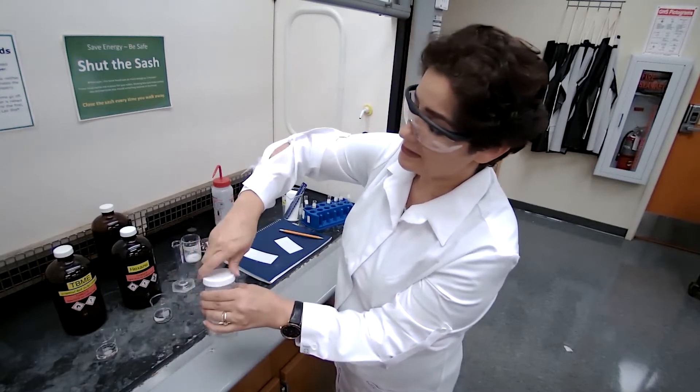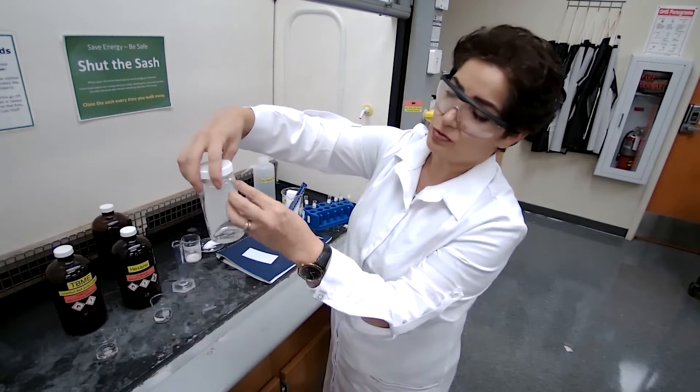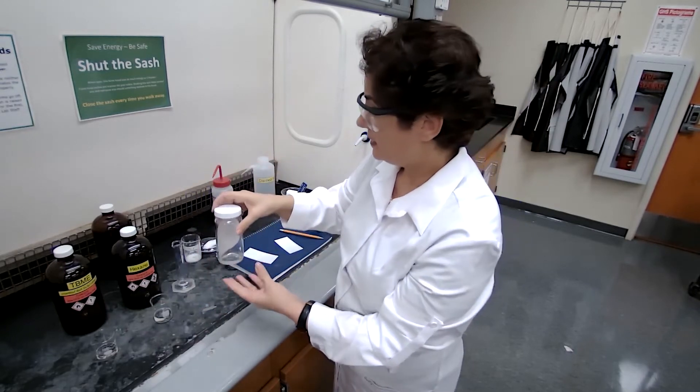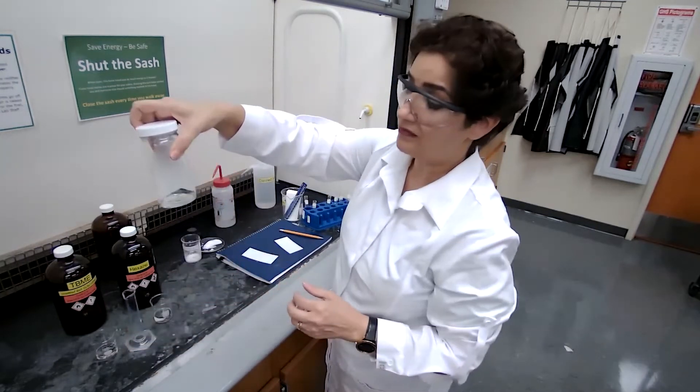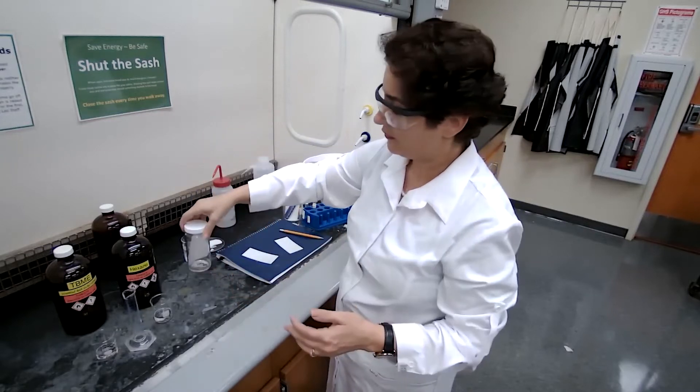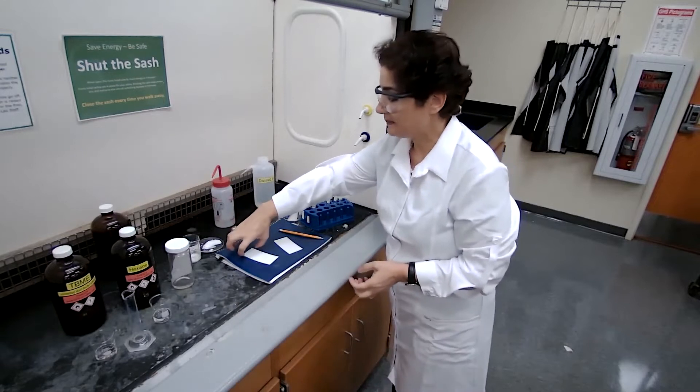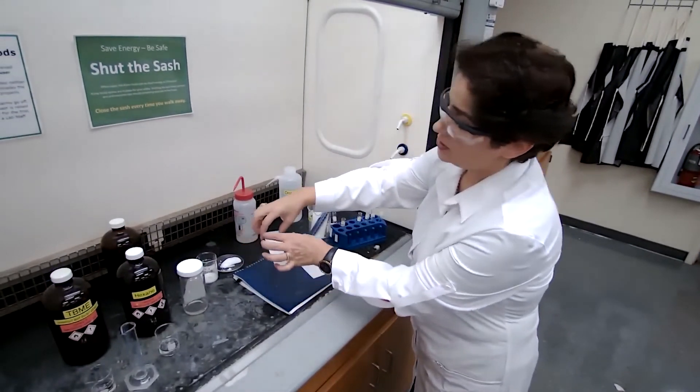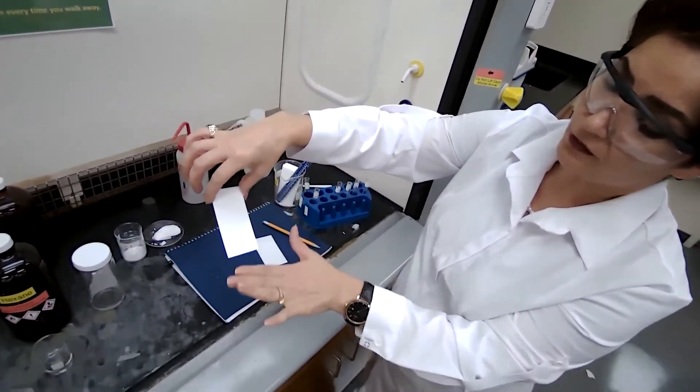We are going to close this jar. I like to swirl it to make sure that vapor is generated inside the developing chamber. It gets saturated with the vapor faster or smooth moving. As I said before, just repeating. Our TLC plate, I again, touching just the side of the plate, not trying not to touch the surface of the plate.